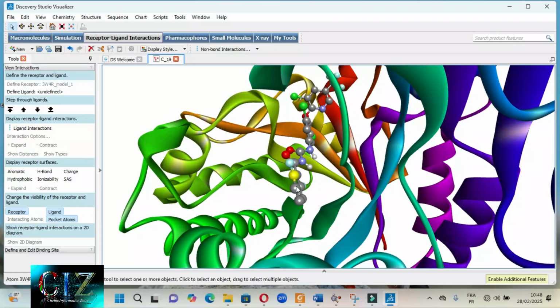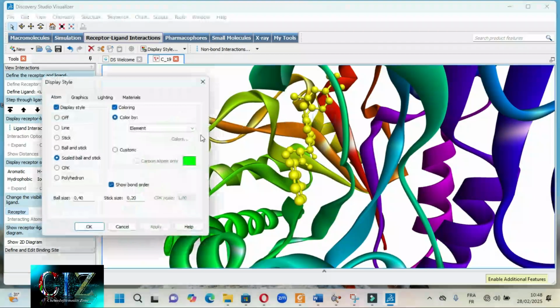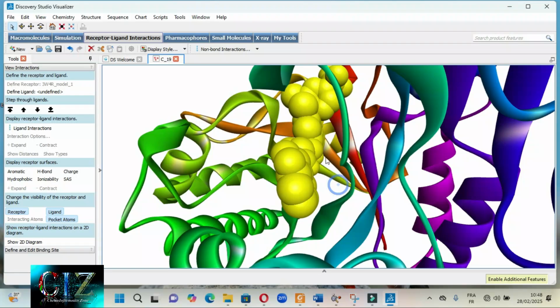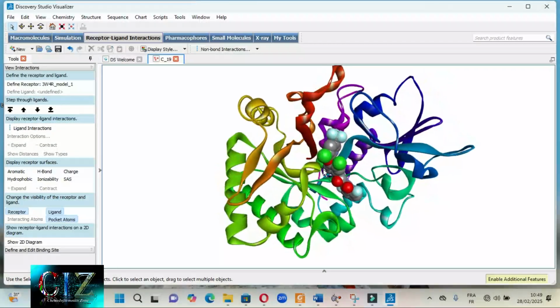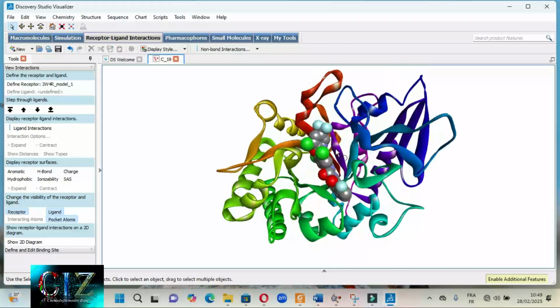Select all elements. Okay, through the third one, I come here, CPK. In the CPK presentation, I have something like that, where atoms are really close to each other, giving a presentation with atoms of a big size compared to the last presentations.